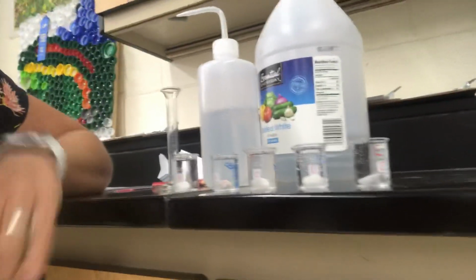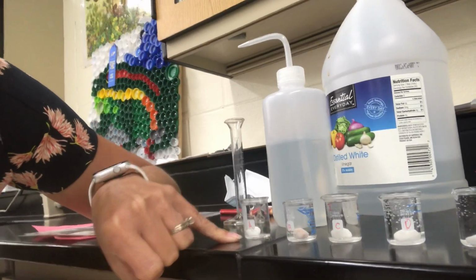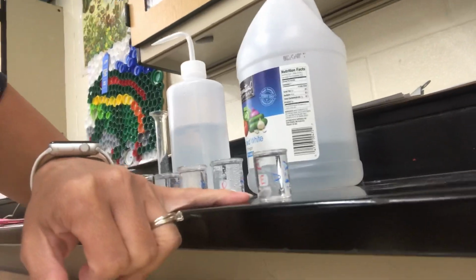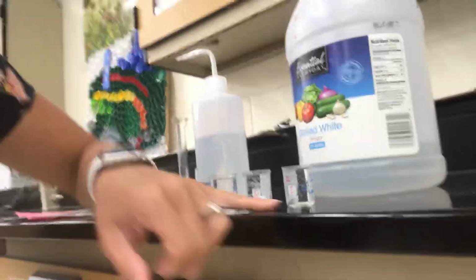So in the first beaker, beaker A, we have nothing but pure distilled water. And so it's kind of our control group. Every good experiment has to have a control group. So there's just 10 milliliters of water here. At the far end, down here in beaker E, we have pure distilled white vinegar. It has a 5% acidity that you can see here on the label.